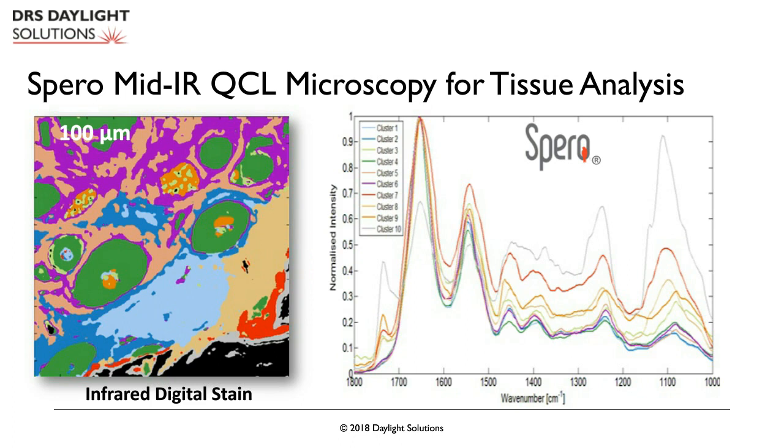So this is the same image, but now you can see a corresponding chart presenting the average spectra of each colored cluster. Most of the clusters follow a pretty similar pattern with slight differences due to specific tissue composition. The small red area in the lower right, however, segments nicely due to its divergent spectra. In this case, the portion of the spectra profile associated with nucleic acids is different. And this area is also, in fact, a region of skin cancer. So it separates itself nicely, and we can use clustering to point it out.